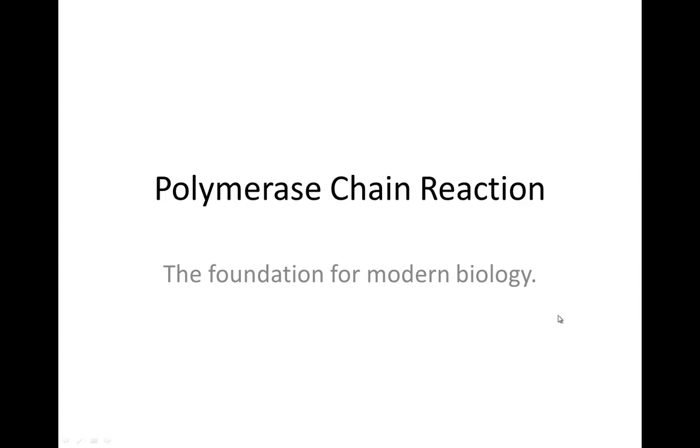Okay, so the last step we're going to do in lab this week is to set up the polymerase chain reaction. So here's a quick little lesson on what PCR is. And it is truly the foundation for modern biology. In a second I'll get to exactly what it is and how it works. Now I want to talk to you a little bit about what it's used for.